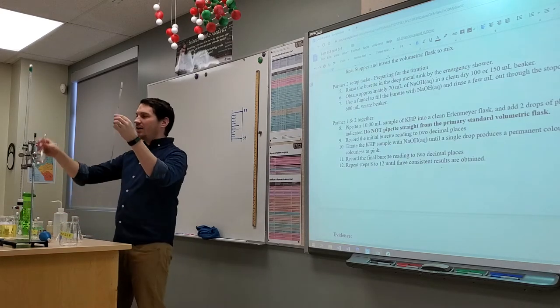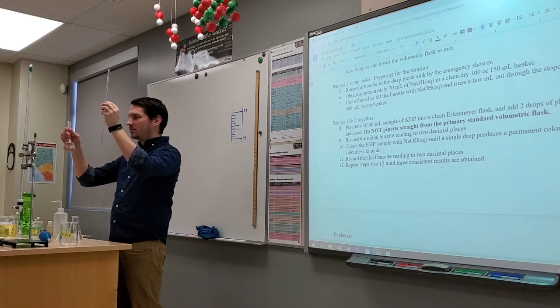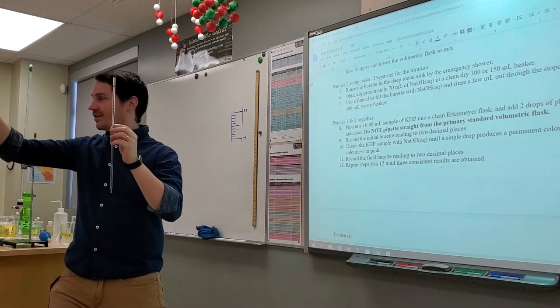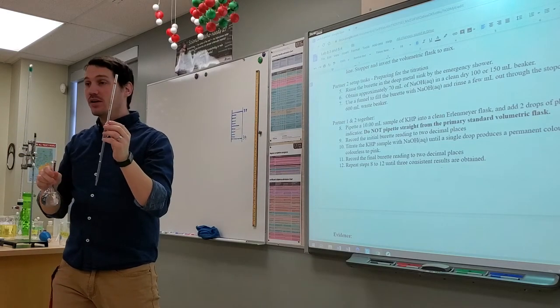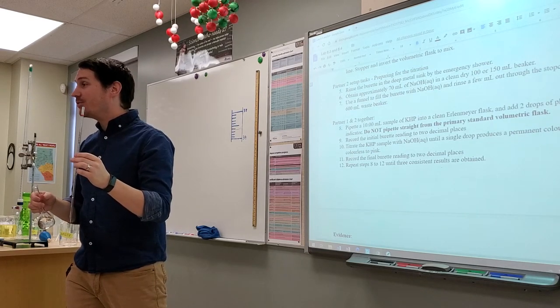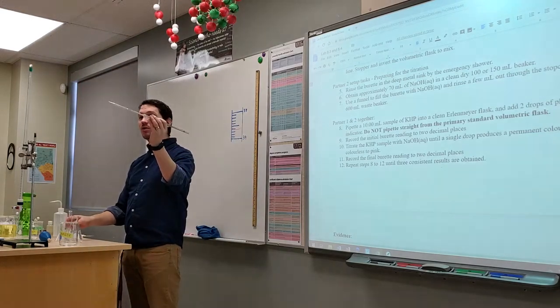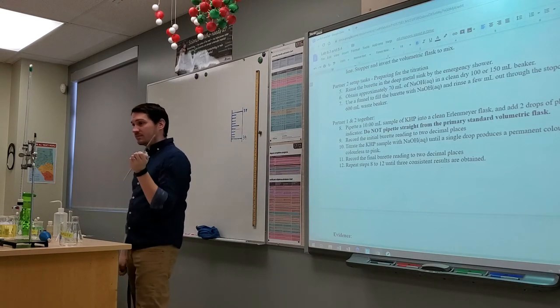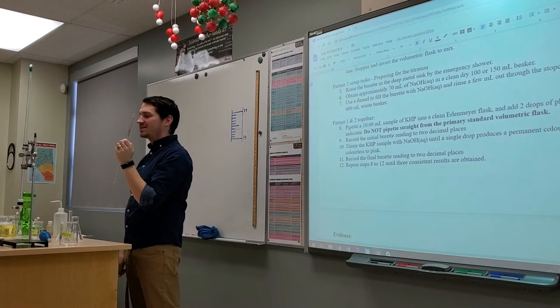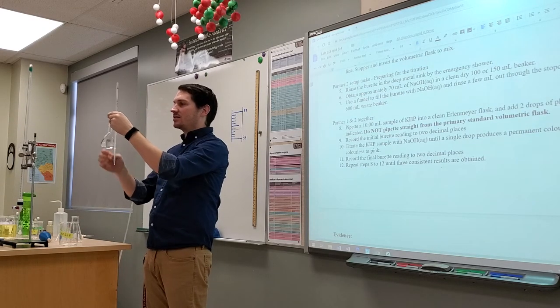Perfect. So now I've got my KHP, and I'm going to take that off, and I'm going to pipette out 10 milliliters. Why do I not want to pipette directly from this thing? Why is it a really bad idea to pipette straight out of here? Because you can knock it over and break it. I could knock it over, and I could dump out my entire solution, and you'd have to start over from yesterday's beginning. That would suck. What else? What if, do you know what these were used for last time? No, you don't. So what if there's a little bit of contamination on the pipette tip? What's going to happen? As soon as I put it in here, well, now I've contaminated my entire sample.